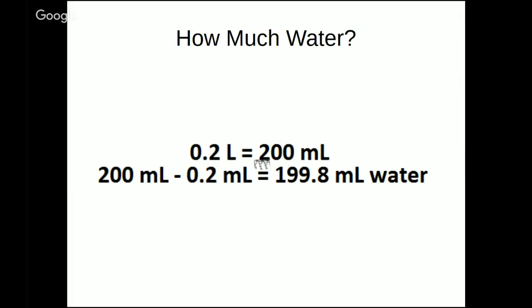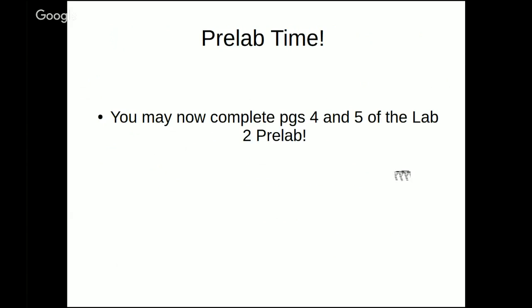All right. So if we were going to make a solution that is that dilute, there's probably actually another technique we would use called a serial dilution. And I'll teach you that one next. But just as an example, this works. All right. So that's parallel dilutions. Hopefully you understand it a little better now.